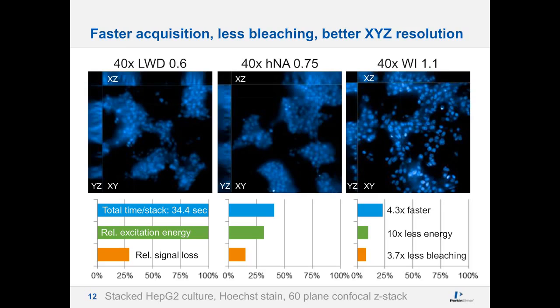If we move to the very right of this slide, you will see the result as it looks when acquired with a water immersion objective. Please note that if you watch the XZ view here and the YZ view here, nuclei are much better resolved in Z when compared to either the high NA or the long working distance objective.